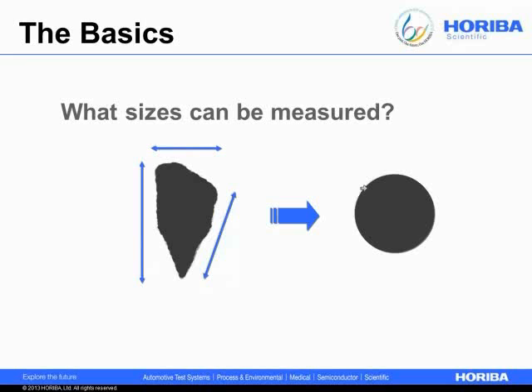So is it important that the D50 really is 18.2 microns, or is it important that the LA950 is saying that it is 19.2 microns, but that when you mill it a little bit longer, the whole size distribution shifts finer? Typically, that's what most people want. So long as the error is being built in for every single measurement, you can still get as actionable information as possible out of the instrument. I hope that makes sense.